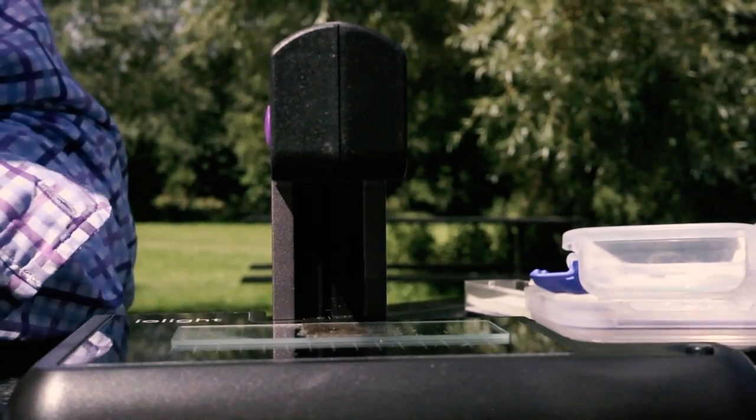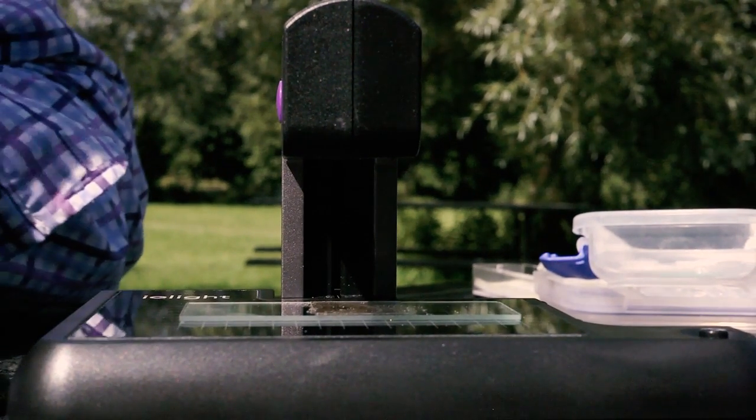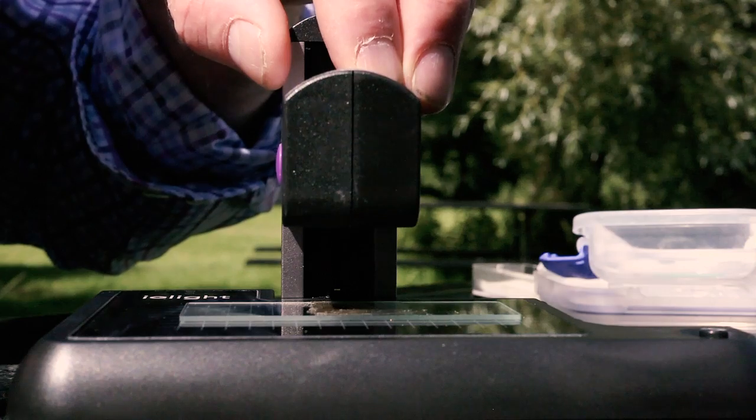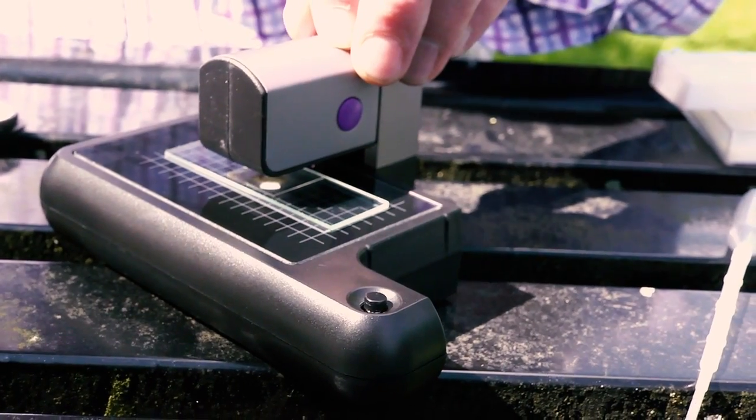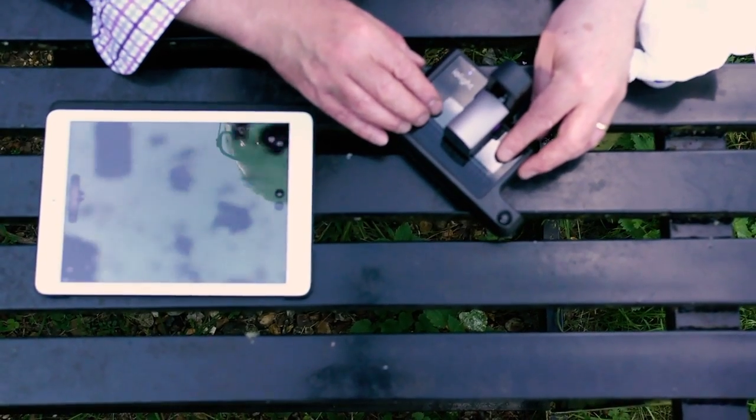The microscope has an illuminator at the bottom and a second one at the top. We're looking through the sample here so we don't need the top one on. I'm just going to turn that off on the screen of the iPad, and we can see that the microscope is working by putting my hand in between. So now all I have to do is to move the head of the microscope by hand down the mast until we see an image. We can already just straight away see that there's loads of movement in there, so we can move the slide around until we find an area where there's loads going on to look at.